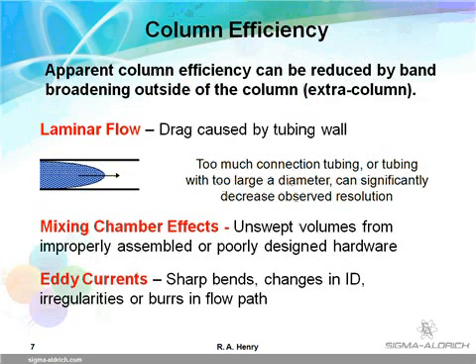An open tube becomes an excellent mixer if the sample spends too much time in this environment. This has the undesirable effect of decreasing N and lowering resolution. Its effect can be minimized by making connections with very short pieces of small ID tubing. More care is needed with shorter columns and small ID columns.